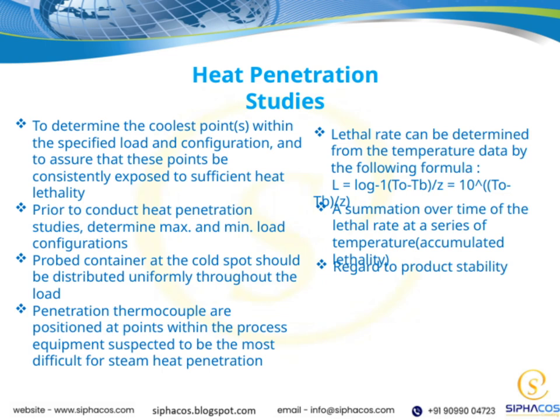These are typically areas where heat might lag or where temperature might be lower, so monitoring these spots helps us verify that heat penetrates effectively and uniformly. Overall, these steps are essential in heat penetration studies to validate that our sterilization process is both effective and consistent, safeguarding product quality and safety.